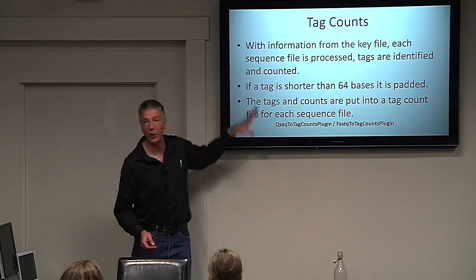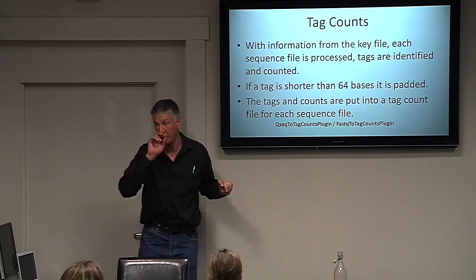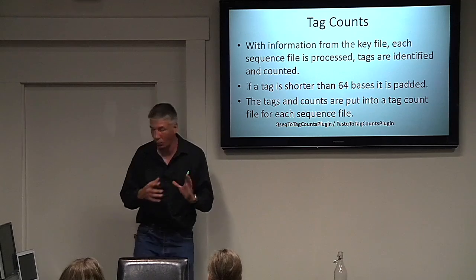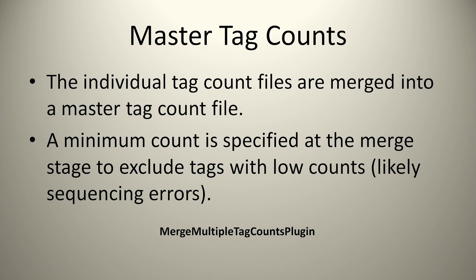As we go through this presentation, I'll have plugin names at the bottom for most of the steps, so it shows you what plugin is being used. And tomorrow we'll go through a hands-on exercise using this. So then there's the master tag counts.